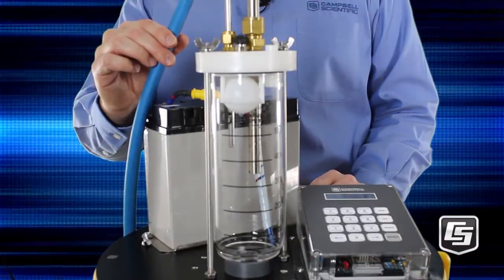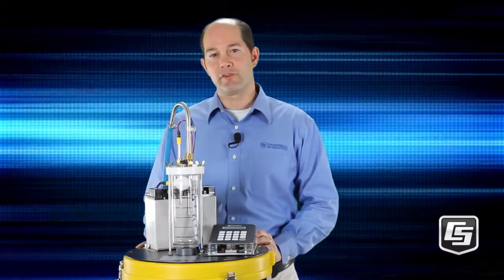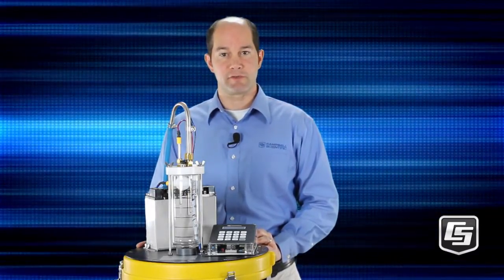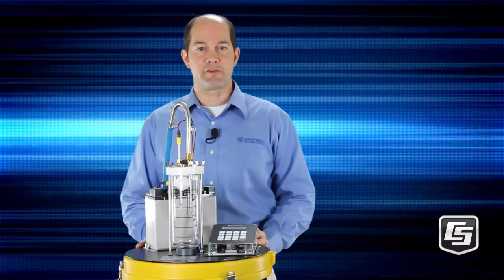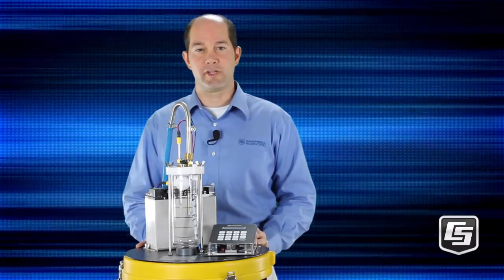The intake tube is then purged once again, and we're ready for the next sample. The amount of water in the chamber is mechanically set, so you get a precise sample volume every single time. You can set the position of the control rod by simply loosening or tightening this compression fitting. The purging cycle is user-set for the time you need to ensure reliable, durable, and long-lasting sampling.